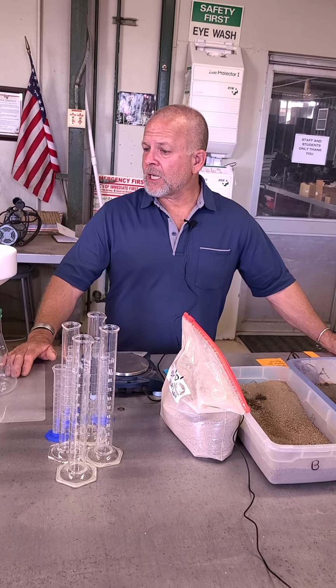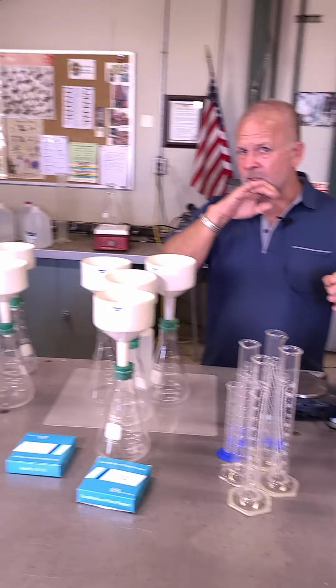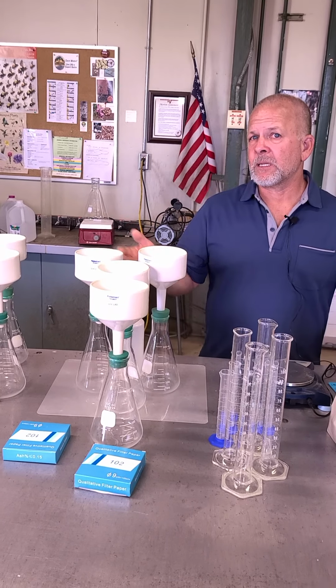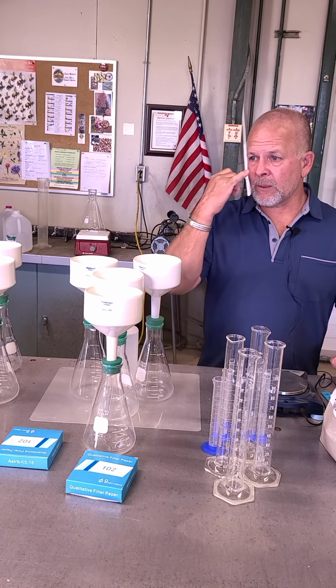Okay? And we're going to put each one of those treatments on these 3 different soils, and we're going to run them 3 times. So we're not just going to take the results of 1 repetition, but we're going to run them 3 times.